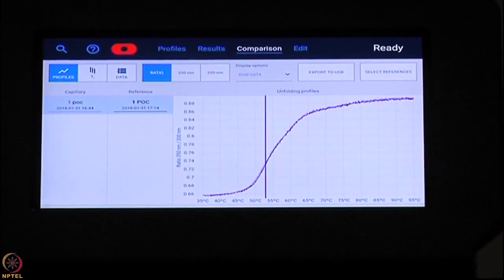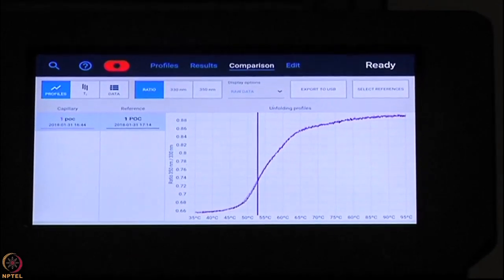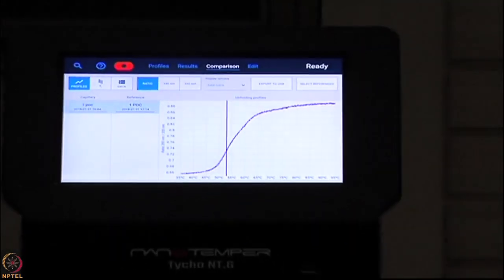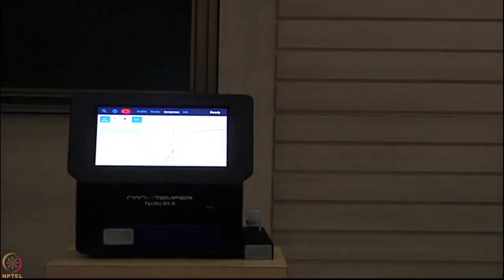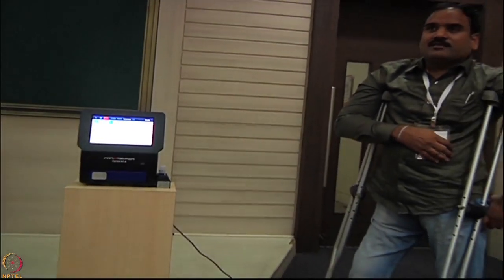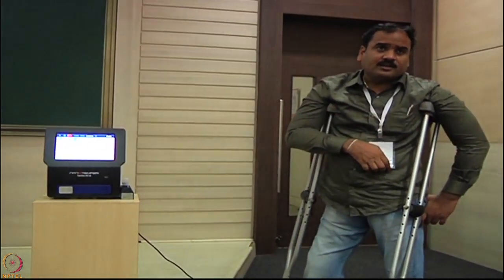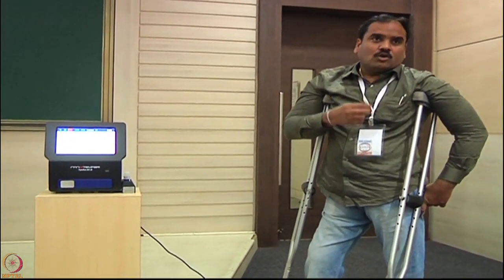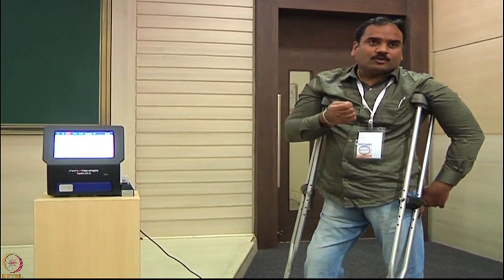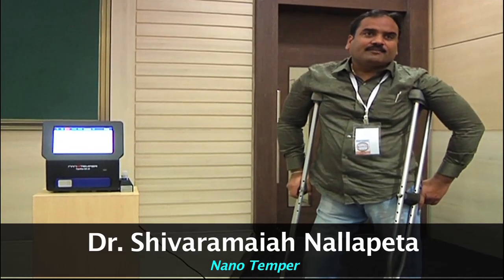If a sample has 2 to 3 proteins in the same sample, it all depends on when each is unfolding. In some, the tryptophans might be exposed, and in some the tryptophans are already buried inside. So in principle you get very non-specific data. Normally, since it's a biophysical method, working with a few proteins is recommended. But yes, many of our customers have tried it with two proteins. They know one protein and they know what the other one gives. It's always an R&D kind of thing.